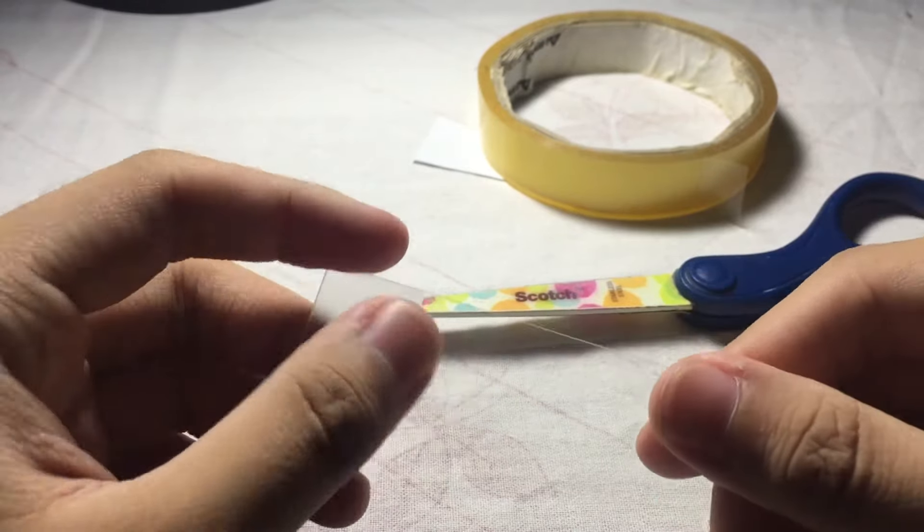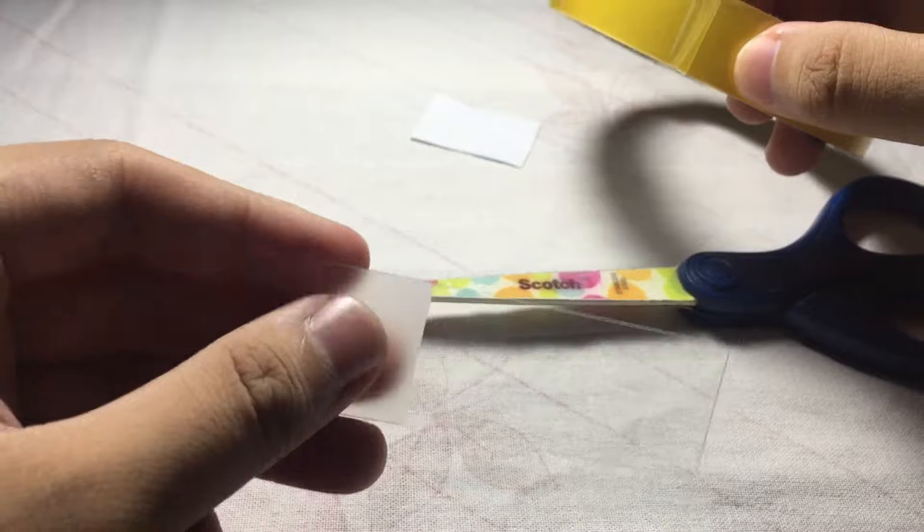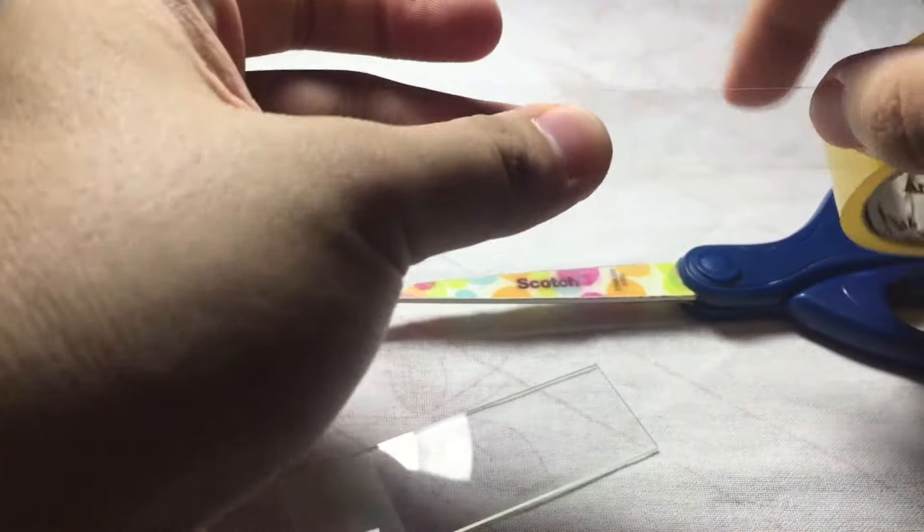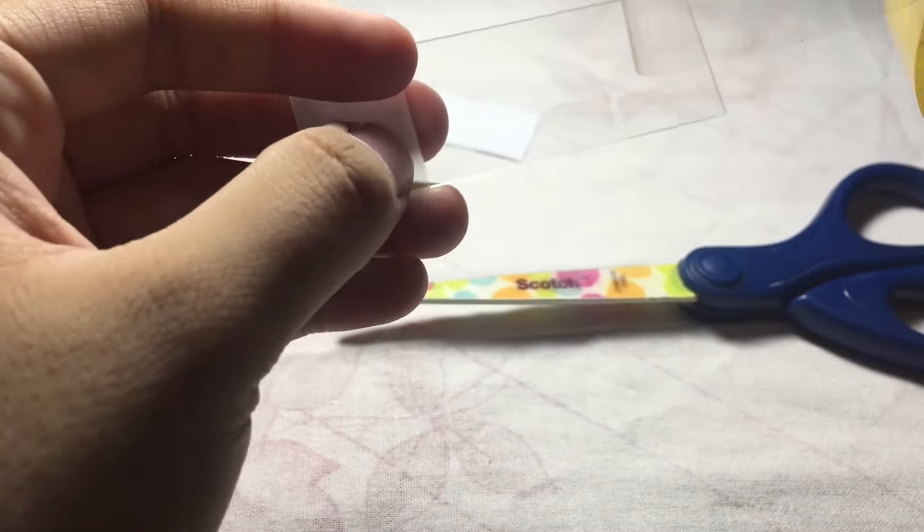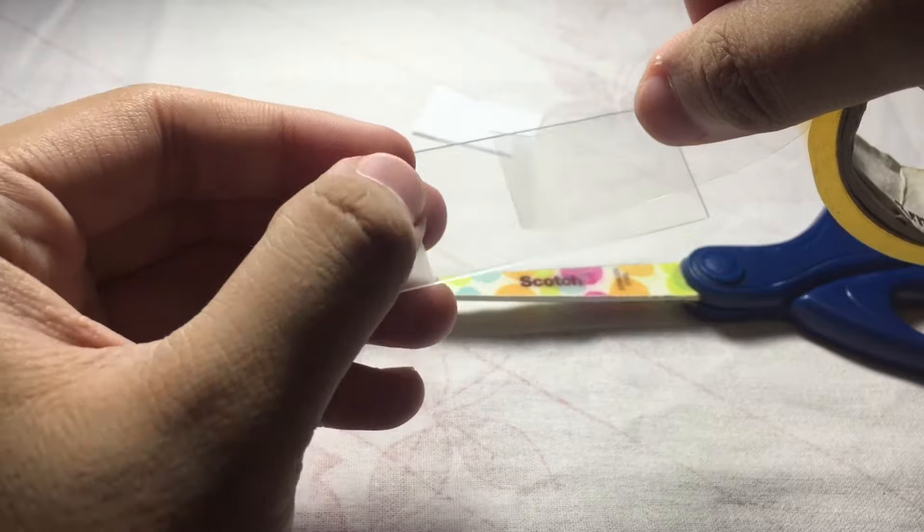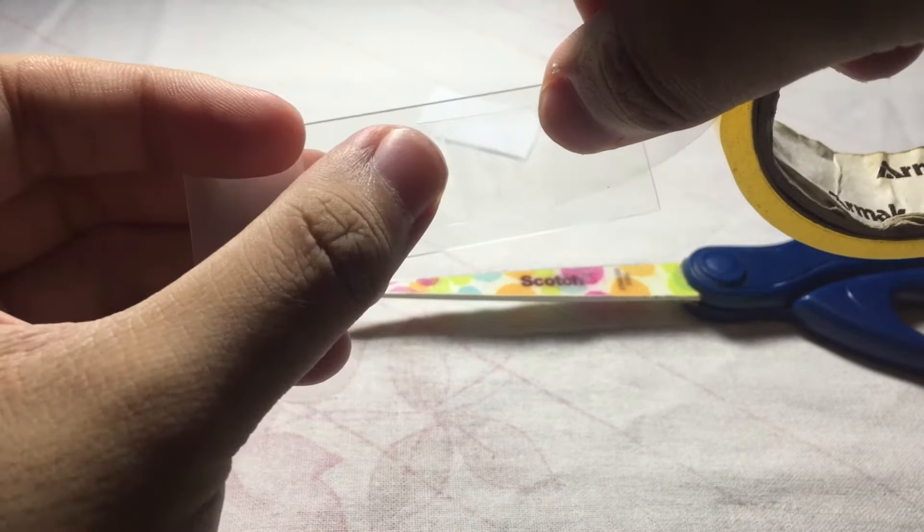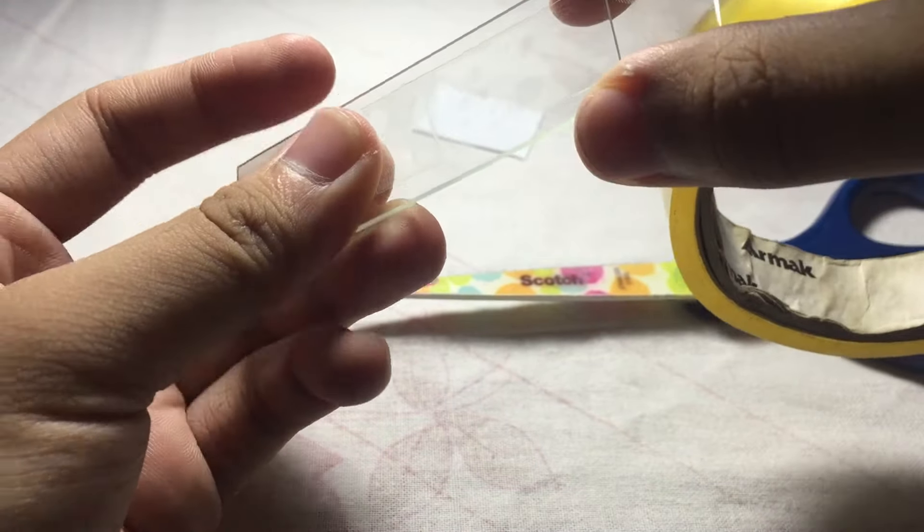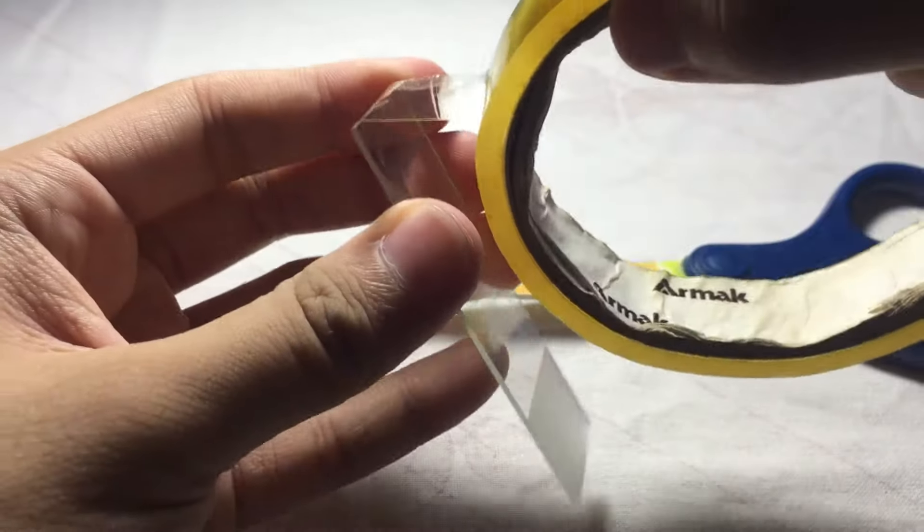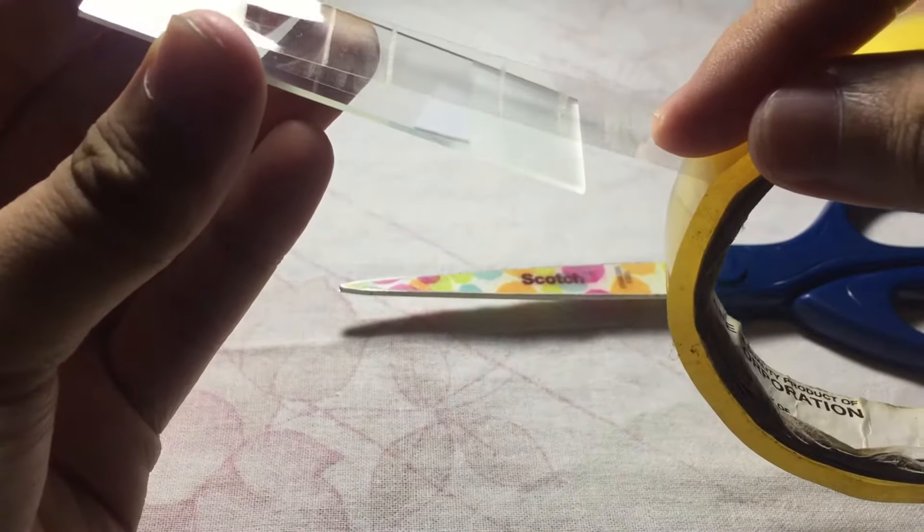We then get your scotch tape. As you can see, it's already freed. Then we stretch that, and at the back of your slide you then attach the freed end about half. Then you pull your scotch tape swab all over the slide, the length of the slide until the end.